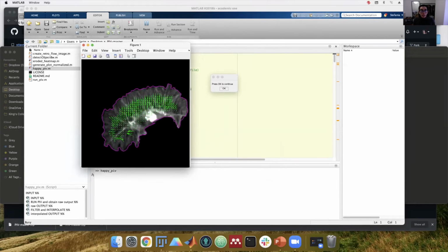So what happened here is that I have fewer vectors available. This is because I increased the size of the source and the search. In this case, the code is still performing correctly, as in I don't have many empty patches. But something to keep in mind is that if you increase the size of the source, you'll also increase the erosion around the edges to avoid edge artifacts.